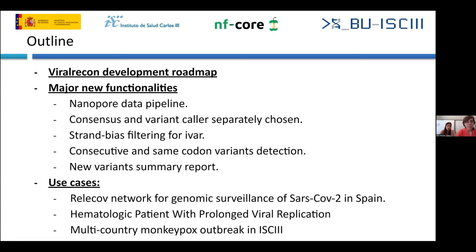followed by the major functionalities in the last releases. As use cases, we're going to talk about the RELECOV network, which is the genomic surveillance network for SARS-CoV-2 in Spain, where we use viralrecon for data analysis. We're going to talk about a paper we participated in regarding a study of a long-term COVID patient. And also we're going to speak a little bit about the work we are currently doing, studying the multi-country monkeypox outbreak in ISCIII, where we are also using viralrecon.